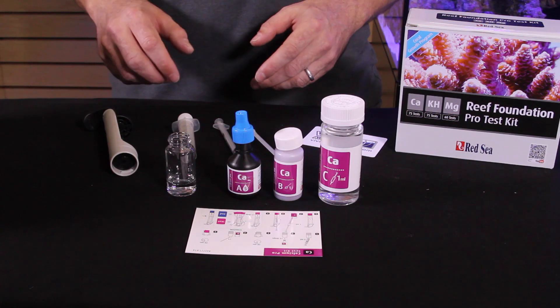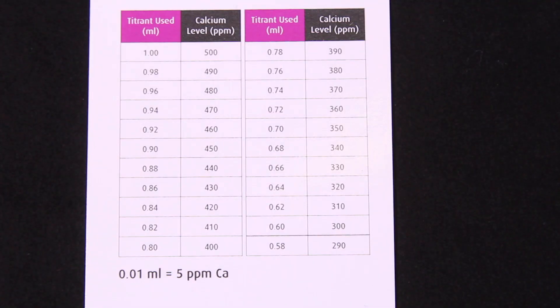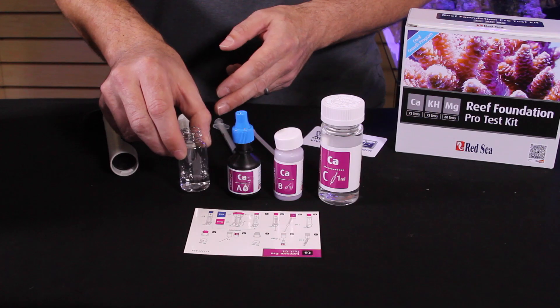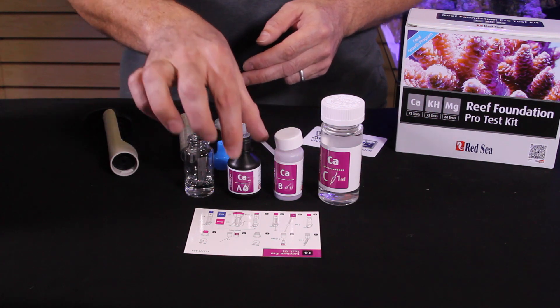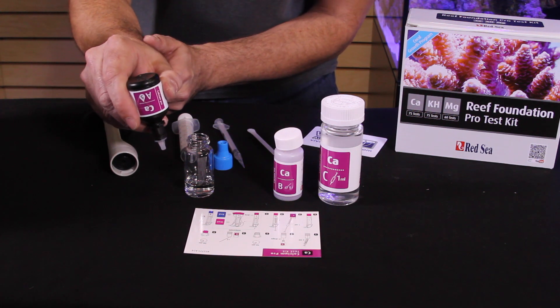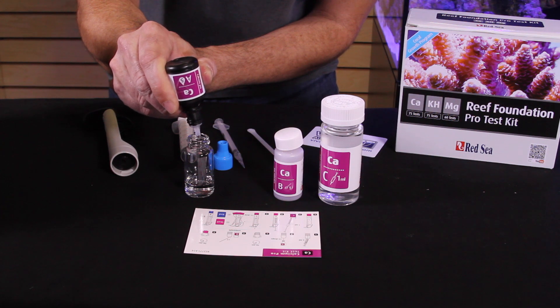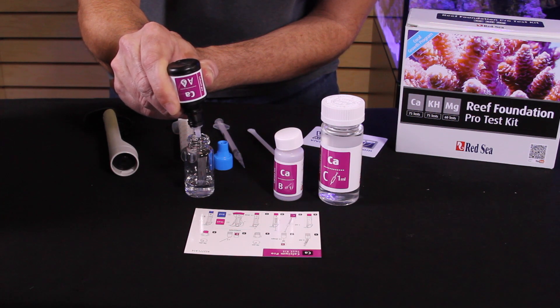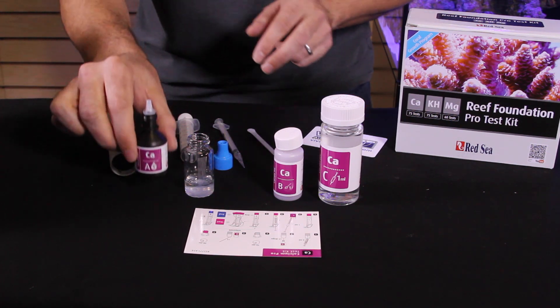Now we're going to test the calcium in our Red Sea Reefer 170. Each test kit has a card with directions on one side and a chart on the other side where you can compare your results. I've already filled the test vial with 5 milliliters of water from our aquarium. The first step is to add 5 drops of reagent A — turn the dropper bottle upside down next to the vial and add 5 even drops.